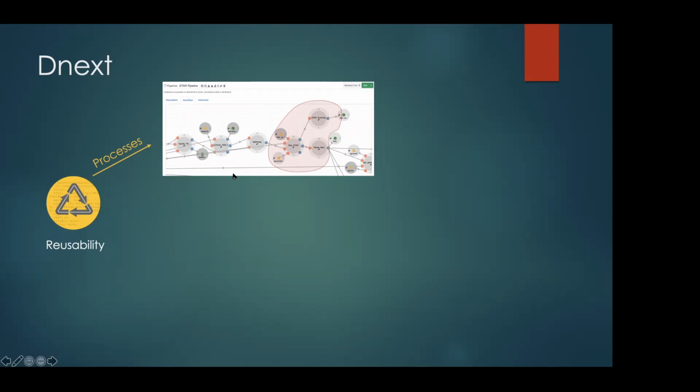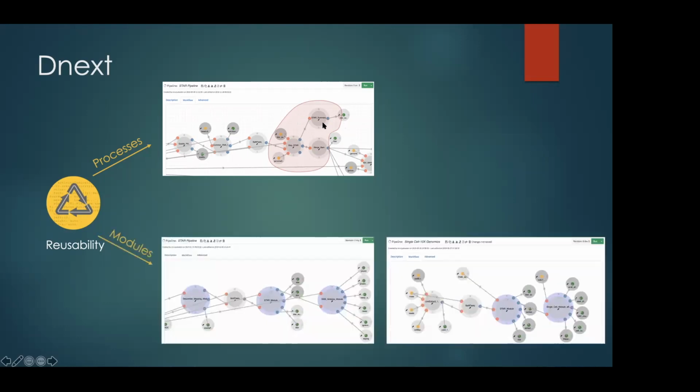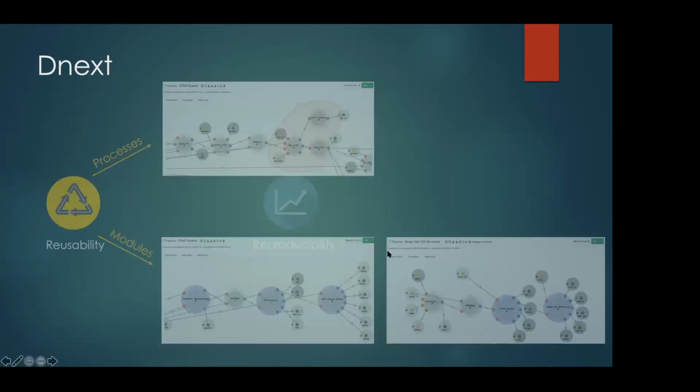You can just use this module. We created this whole thing as a module. When you put the module in, it supports all these steps in here, and it just simplifies how you look at this pipeline, because when the pipeline becomes complicated, understanding what's going on becomes extremely hard. We are just trying to make it more modular and group them, so that when you look at the pipeline, you will know what you have here.